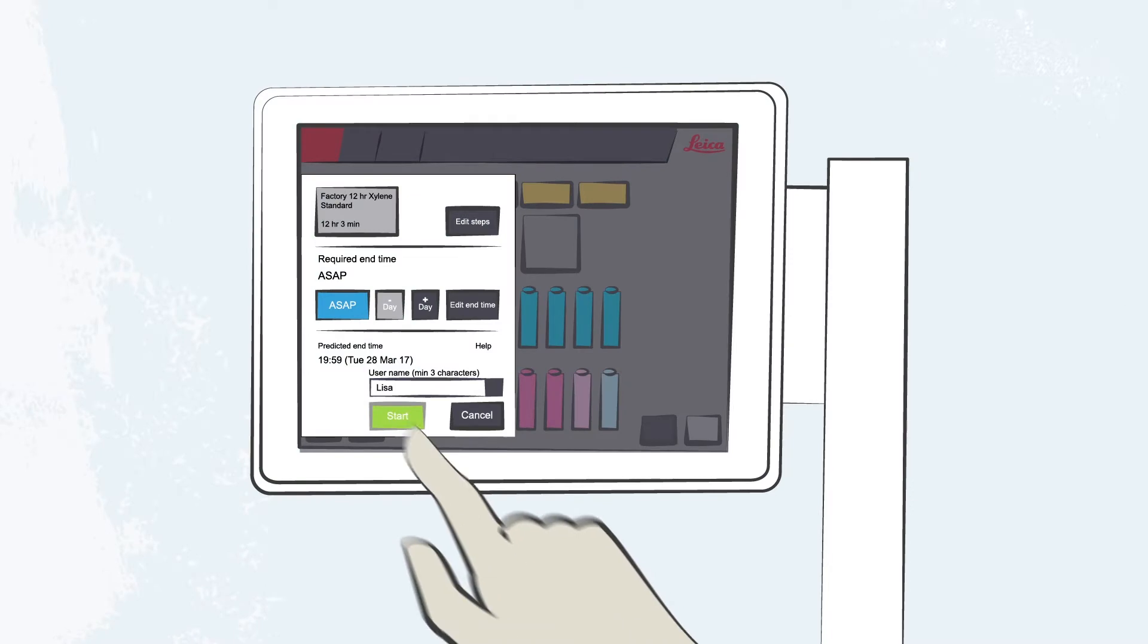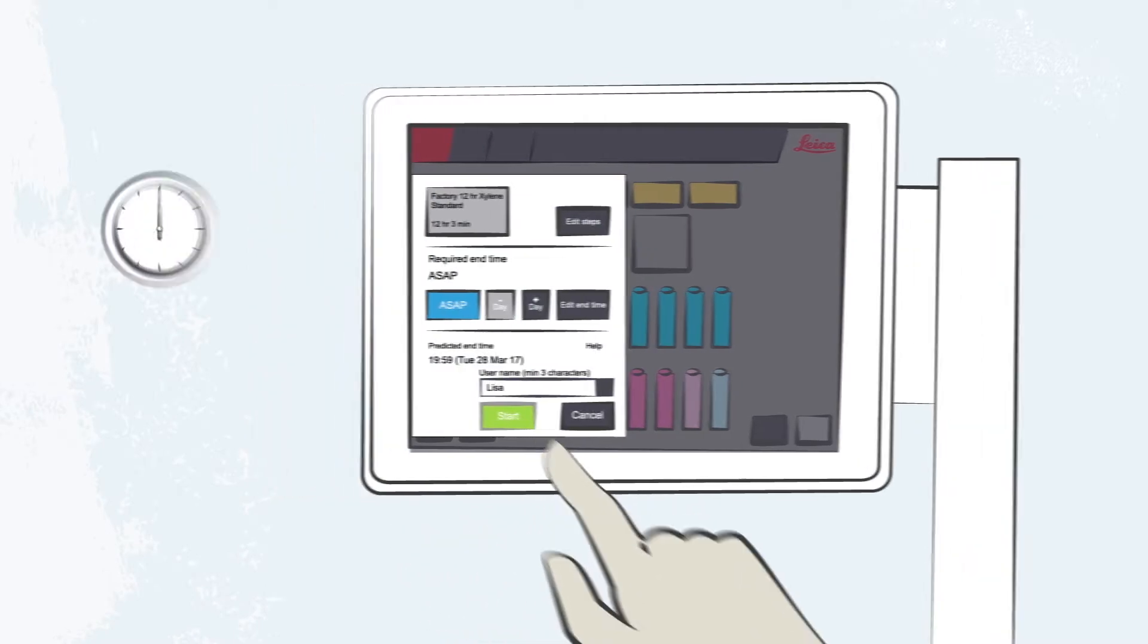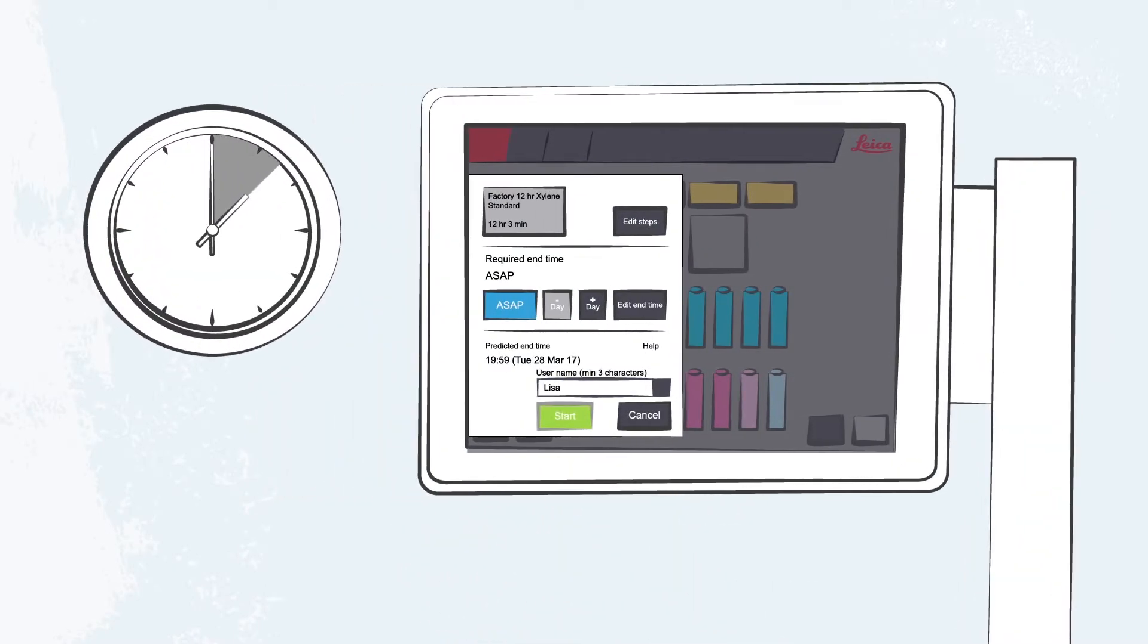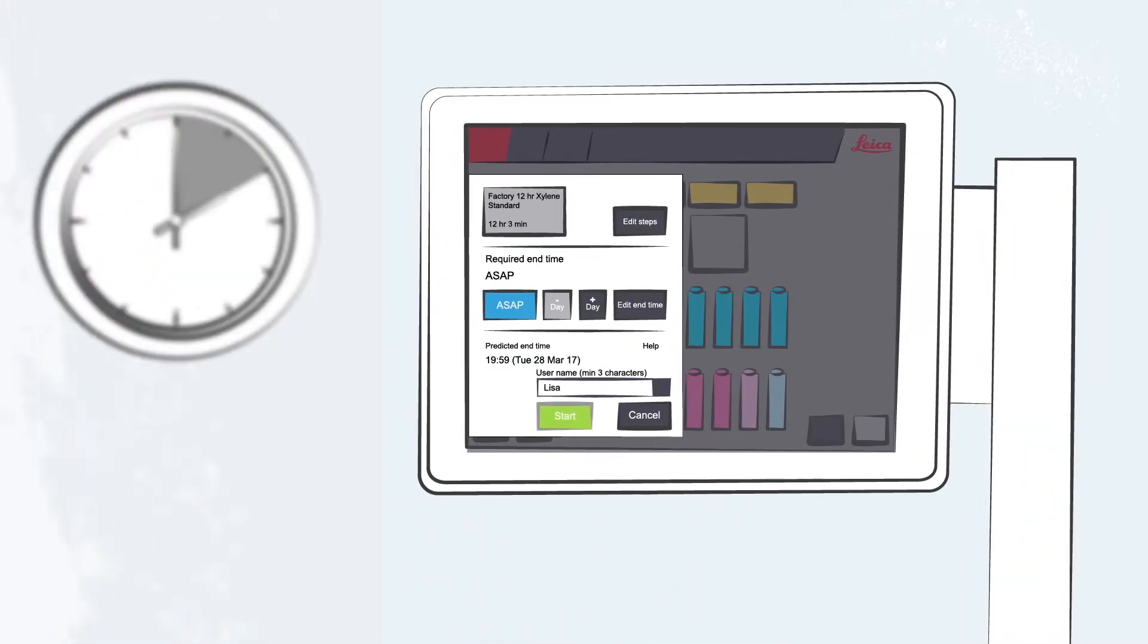Lisa starts a rapid protocol. In two hours, she will complete her shift and the samples will be ready for embedding.